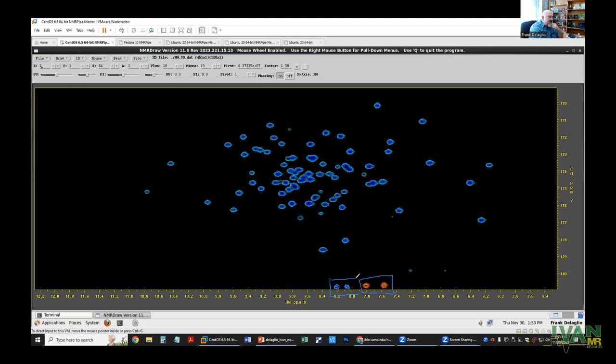So there are things that you could do when you generate a peak table of this data. You could identify these peaks as folded because they're negative and add one sweep width or subtract one sweep width to their chemical shift position. But there's not too much that you can do to the spectral data to move the folded peaks into different positions without also moving unfolded peaks. Does that make any sense? Yes, yeah. But generally, the peaks that are folded, like you have on the screen, can be dealt with by doing a complete left shift or right shift of the spectrum, you know? Yes, but that also shifts the unfolded peaks. Yes. Yeah. Thank you. Yep.